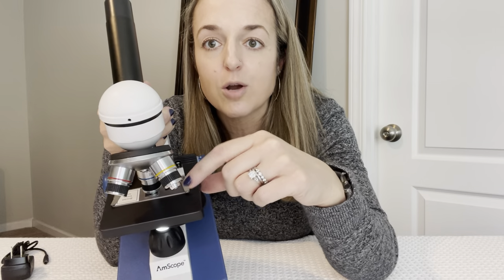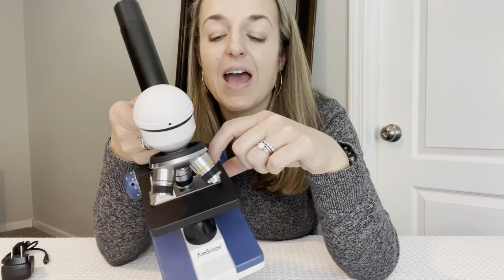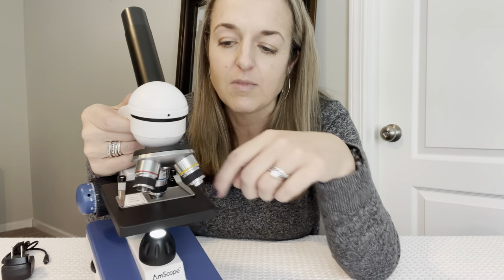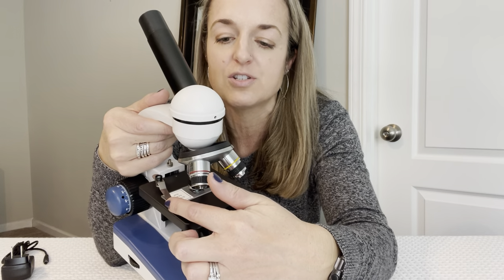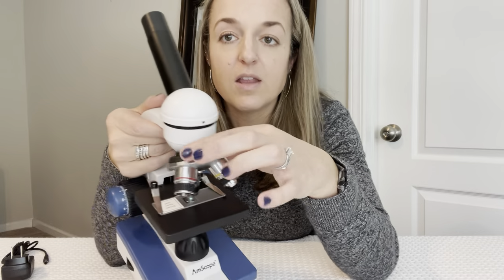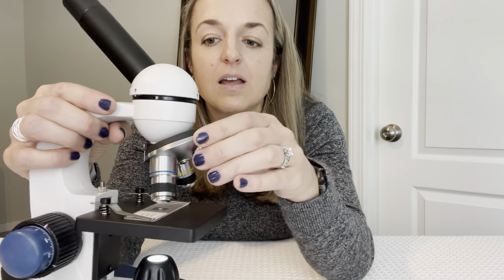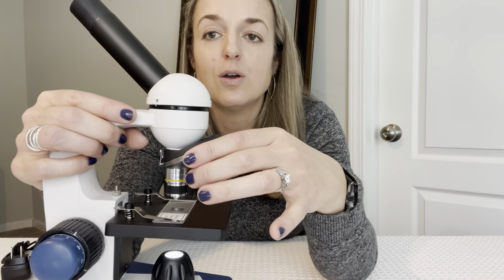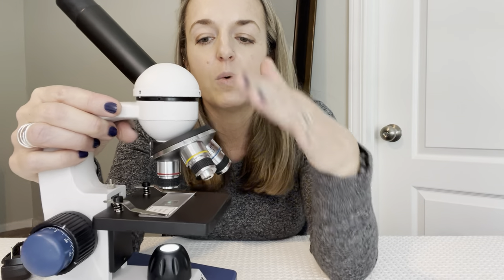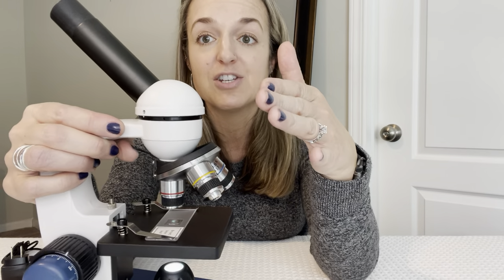We have the little arms that you would expect, and I have a slide in here just to demonstrate, but please note it does not come with slides of any kind. There are two little metal arms on each side. We can rotate through the three magnifications, and listen — did you hear it click? That's how you know you're in place.